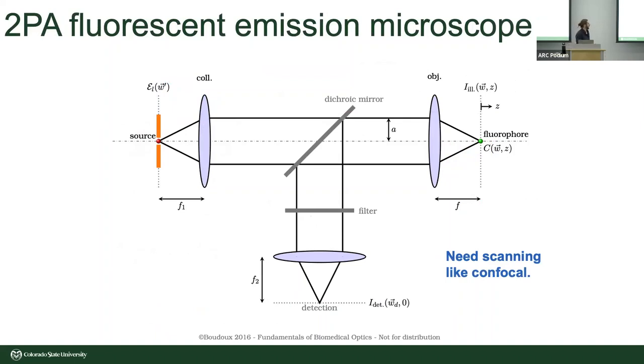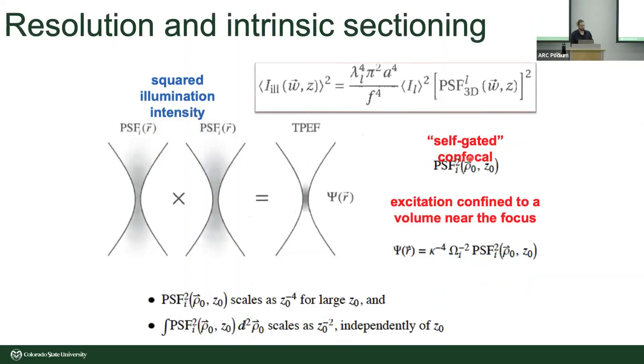So what I haven't shown you yet is a system diagram, and I was kind of loath to show you a system diagram because I feel like it distracts from some of the more interesting images. But briefly, the way we would form an image in laser scanning fluorescence, whether it's confocal or two photon, whatever the source is, we want to focus to a nice point spread function as tight as we can within the specimen. And then in confocal, we would image relay that spot onto a confocal slit and measure the intensity that makes it through that slit. In two photon, we can remove that slit. But what is still true is that we need to move that specimen around, right? Or sorry, we can move the specimen or we can move the laser spot through the specimen.